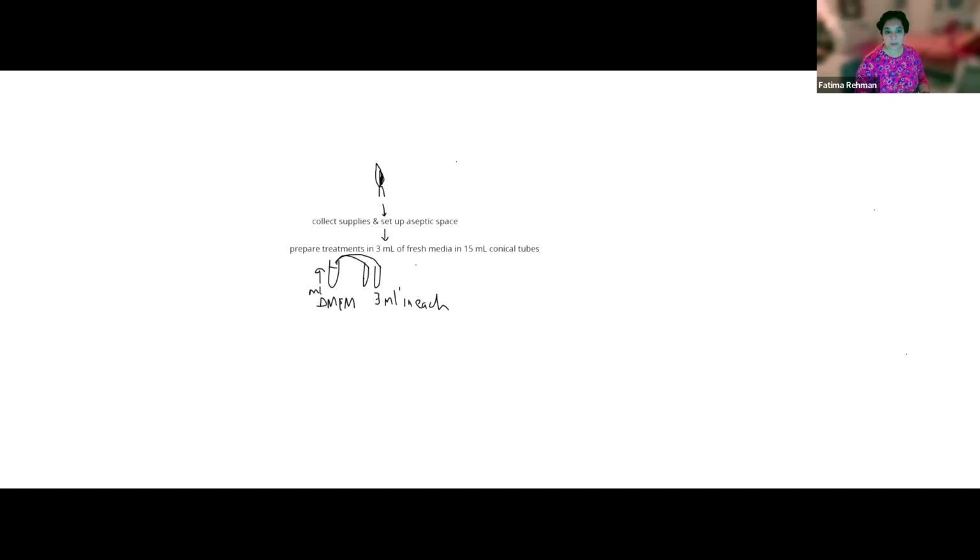And so then this one would have been your untreated, and then you would have your natural supplement and your active component. Okay? So you went ahead, you prepared your treatment, right? Untreated, natural supplement, active component. We got them. Now, what do we do? What's next?